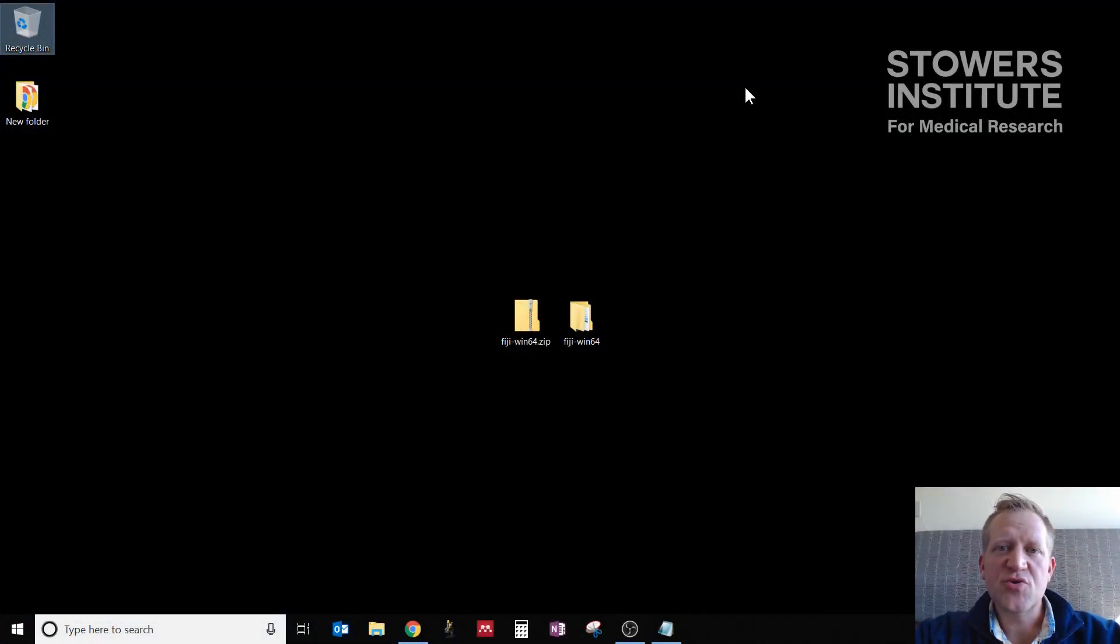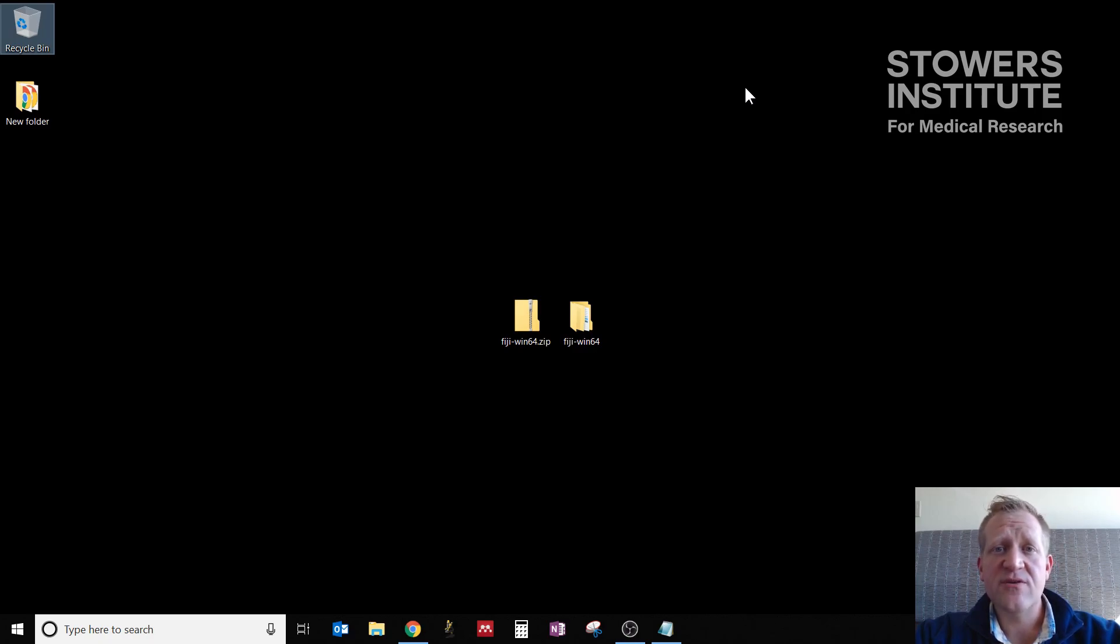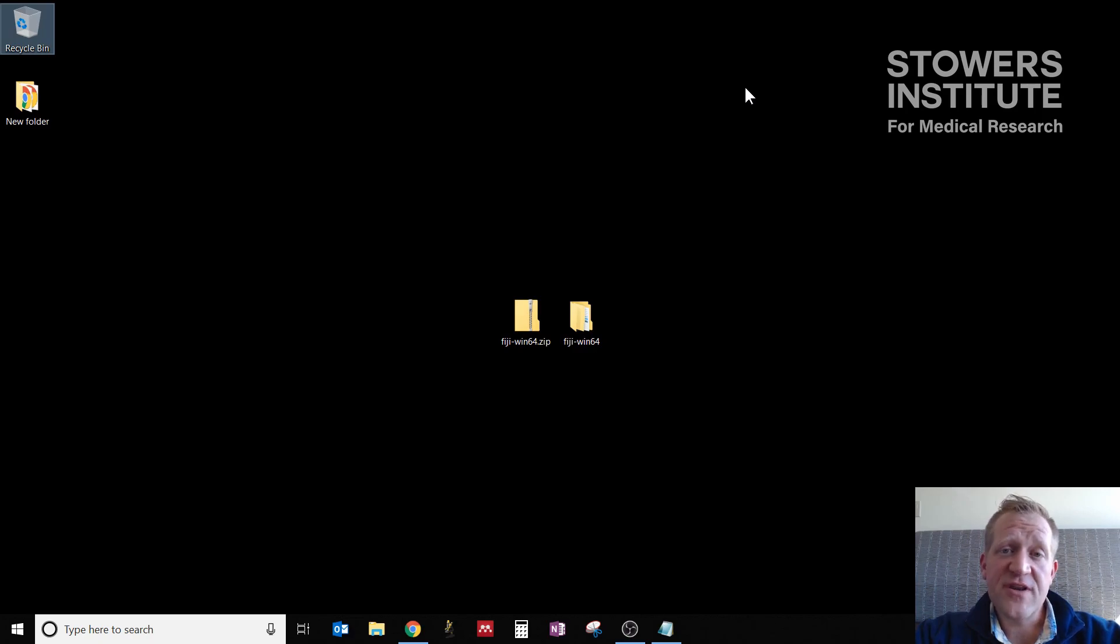We're going to host a series of short YouTube videos which demonstrate typical workflows that we use in Fiji for image processing. In this first video, we're going to work through how to get Fiji set up on your computer.